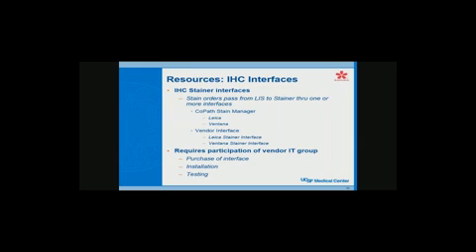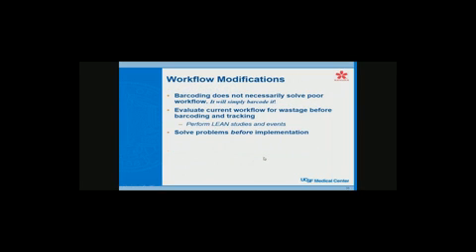And one of the issues with this was that they didn't want these stainer computers to have access to the rest of the network. So we had to put in firewalls between the stainers and the rest of the network. This is something that kind of surprised me, but not totally. I was reading some newspaper articles after that and found out that hackers now are getting into IT systems through things like copy machines, laser printers, all kinds of different instruments that have computers in them and are on networks. So a stainer like this is on the network, and it's possible that somebody could hack into that stainer. So it's kind of interesting how all this is going.